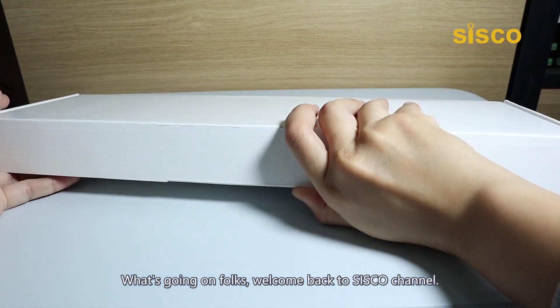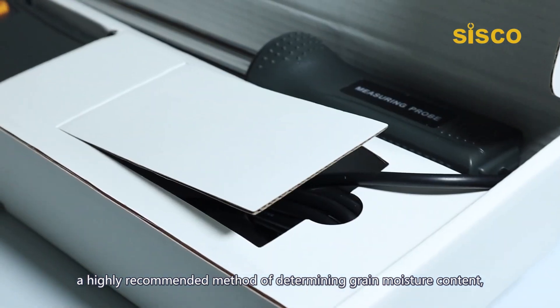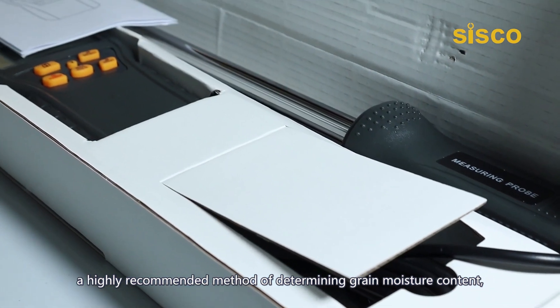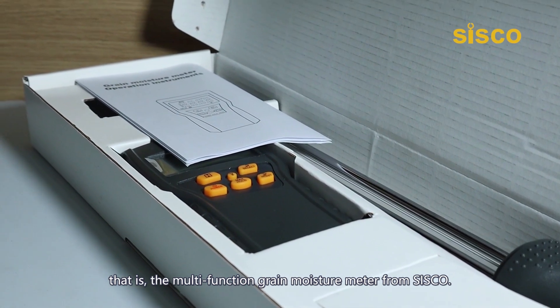What's going on folks? Welcome back to SISCO channel. Today in this video, we're going to introduce to you a highly recommended method of determining grain moisture content — the multifunction grain moisture meter from SISCO.